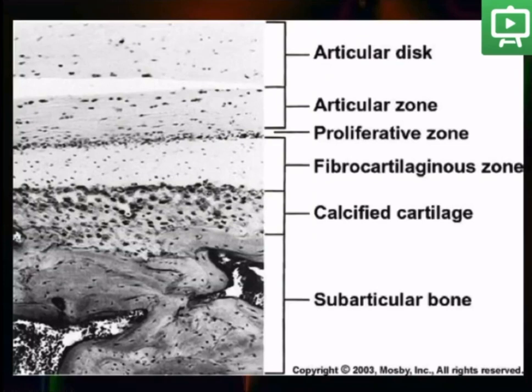Histological section of the lower compartment of the joint, showing the articular disc connective tissue and the articular surface of the condyle made of fibrous tissue. In adults, this fibrous layer is made of fibroblasts and fibrocytes, collagen, and elastin fibers.